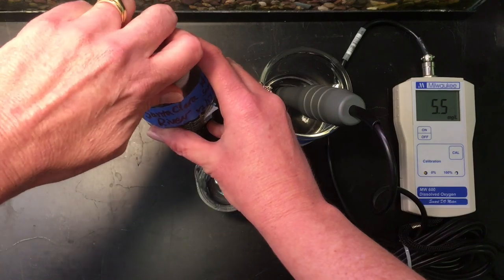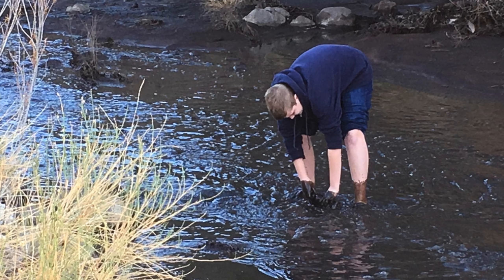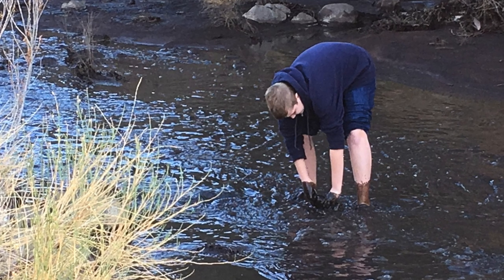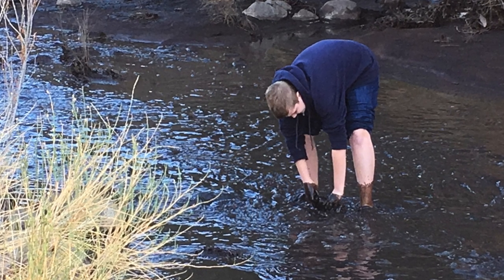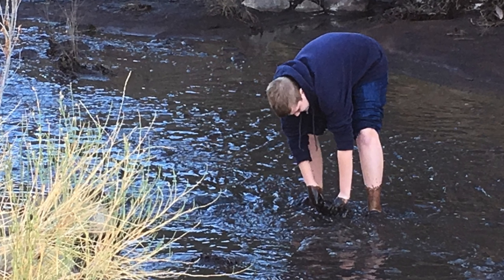So let's see what it is today, a year later. Here's a picture of when we collected that water sample. Notice how the water is very brownish black. That is runoff from ash and debris from fires.